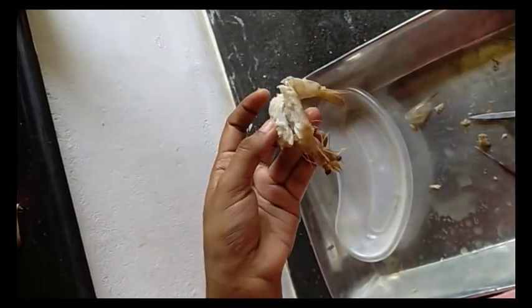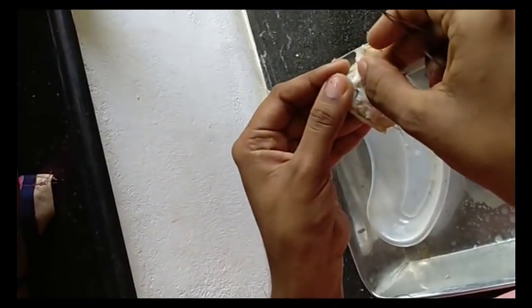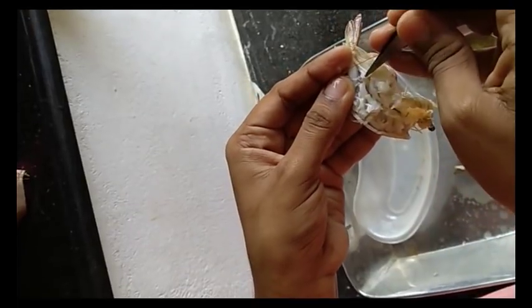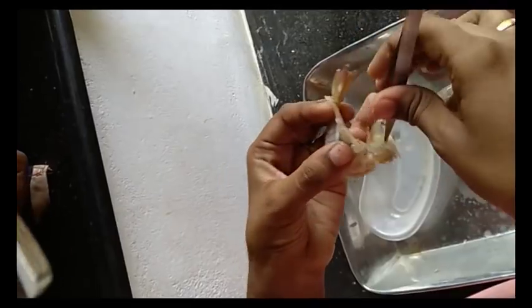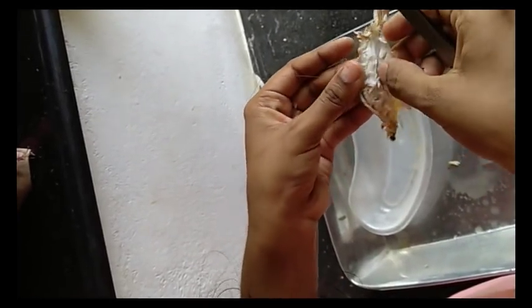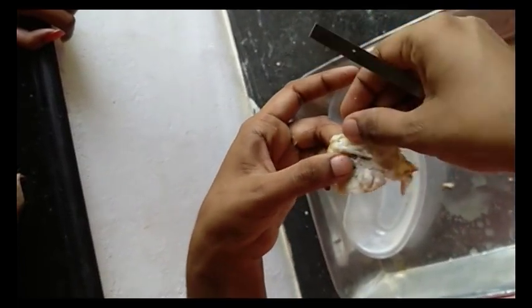You may see that. See here, the nerve is going through this side. So I have to expose the muscles over here to see the nerve. Here, through this side, down to the tail region. Here it goes. Down. You need to clean it. Okay, here. See the nerve? Here.